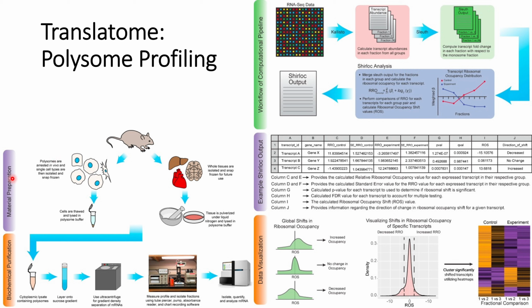In this material preparation, we need to first prepare the polysomes.